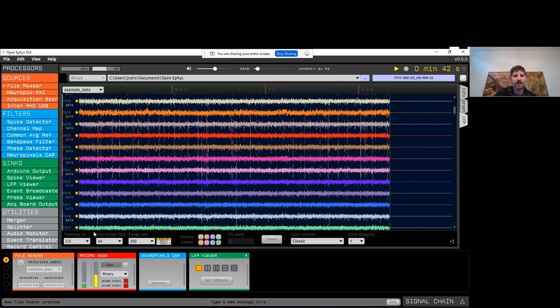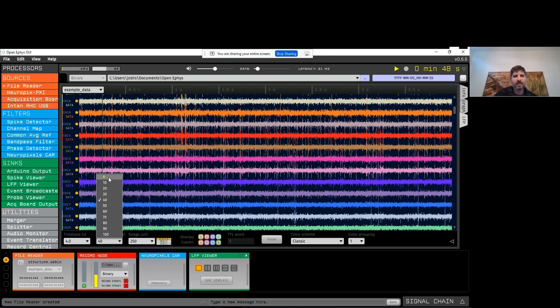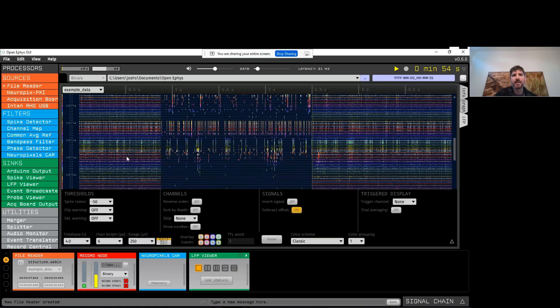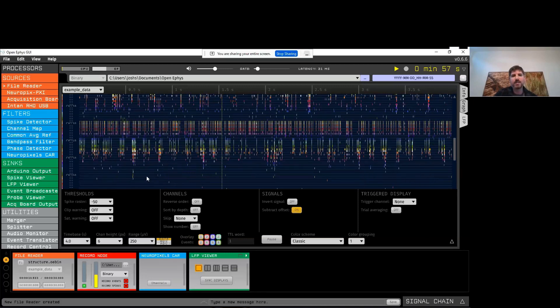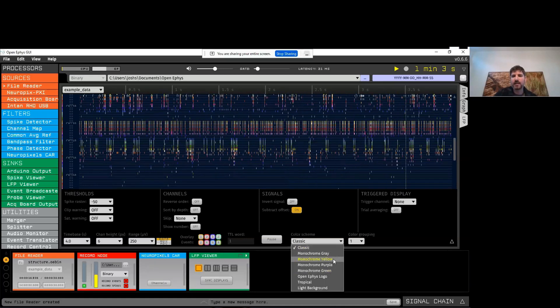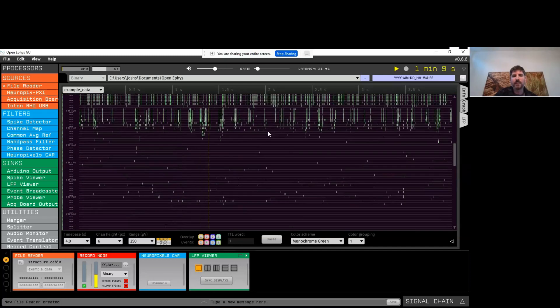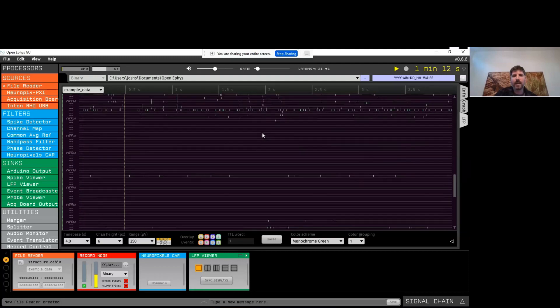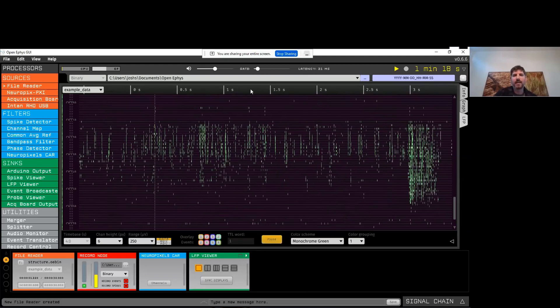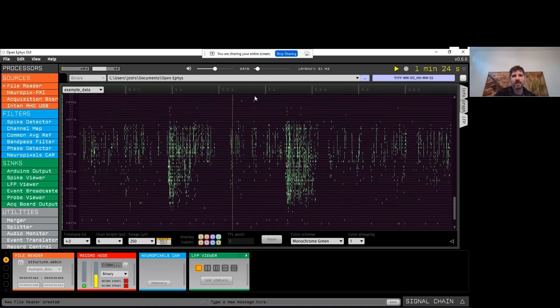You can also change the time base to a longer interval, change the channel height to view more channels at once, and set a spike raster display. Instead of visualizing continuous signals, you just see a single vertical line for every spike detected. You can change the color scheme — for example, to green — and browse through all the spikes on the probe. If something interesting scrolls past the screen, you can double-click on the timeline to scroll backwards in time to see what you missed, then double-click again to return to real time.